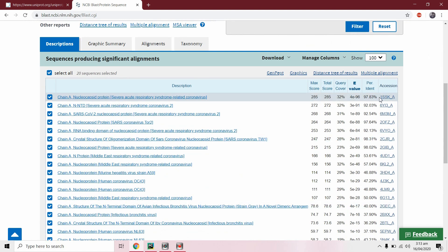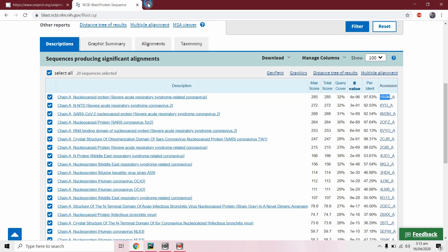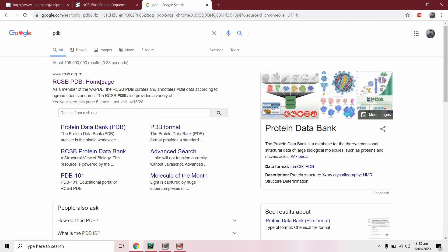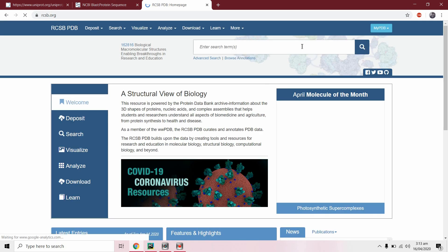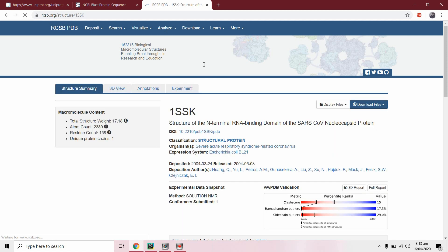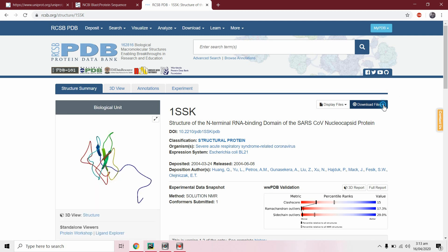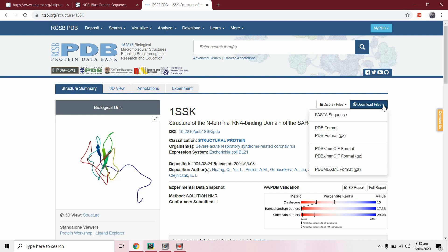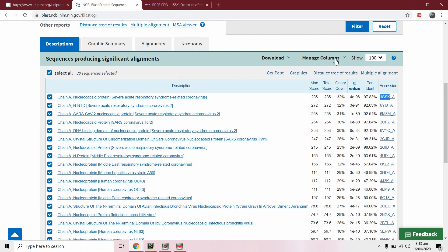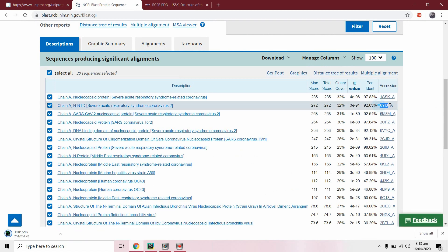We will search these IDs in the PDB database and download the files in PDB format. We will select the top three hits.